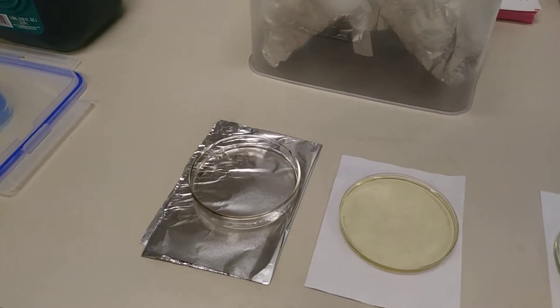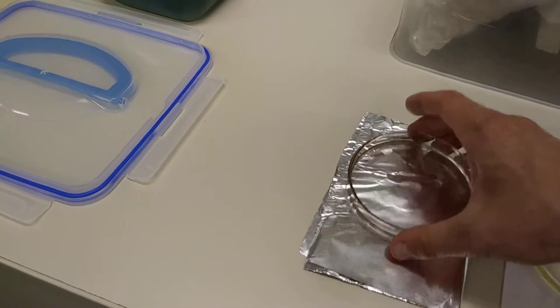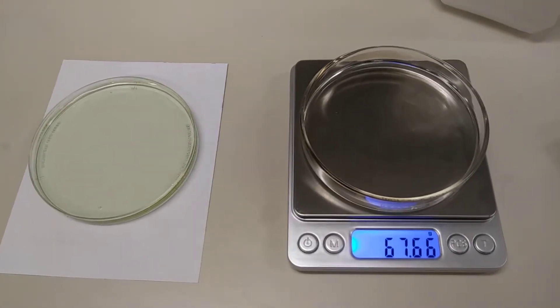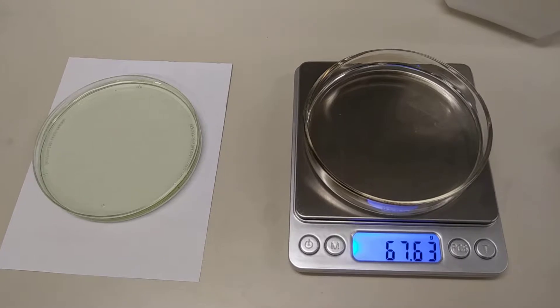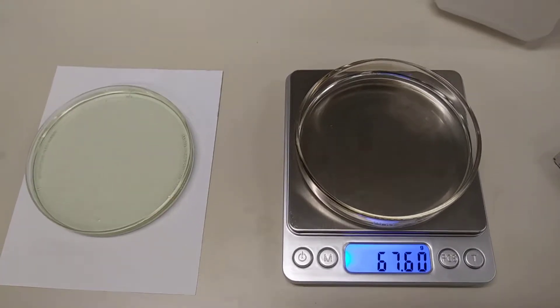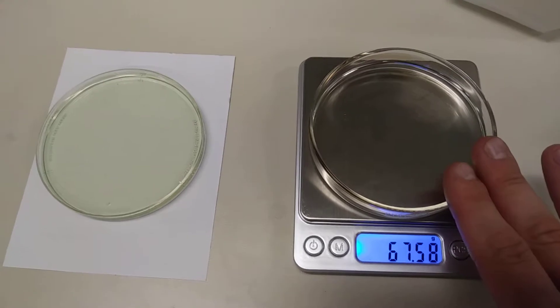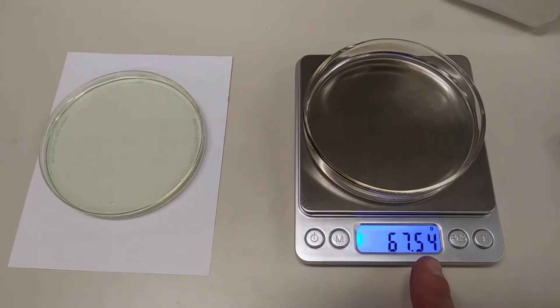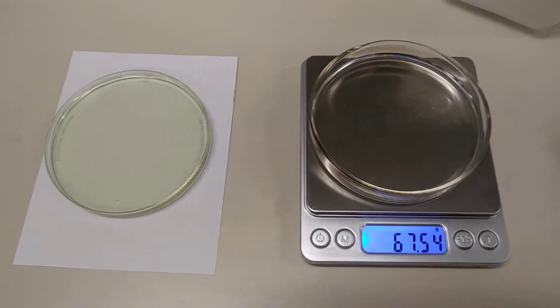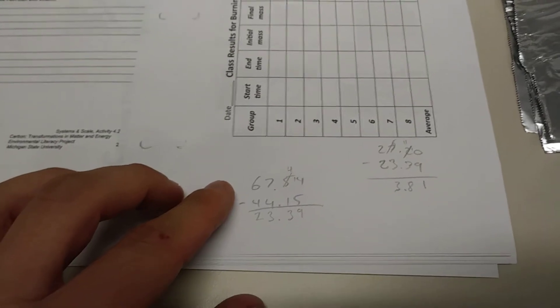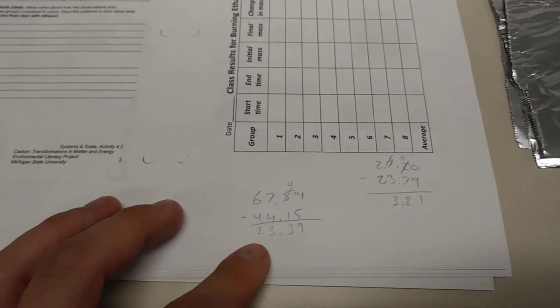Now we're going to take our dish and we're going to weigh it. All right, 67.66. Now you have to understand what this means. The scale shut off, and it is not accounting for taring the dish. So the mass of the ethanol here is actually this number, 67.54 minus 44.15. I subtracted the mass of the dish to get 23.39 grams. So that's the mass of the current amount of ethanol in the dish.